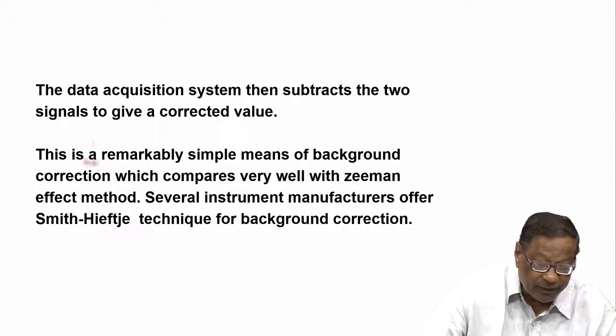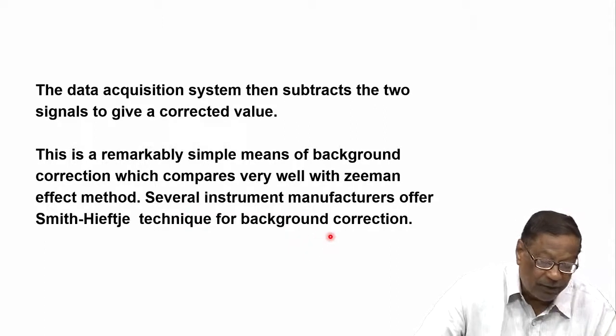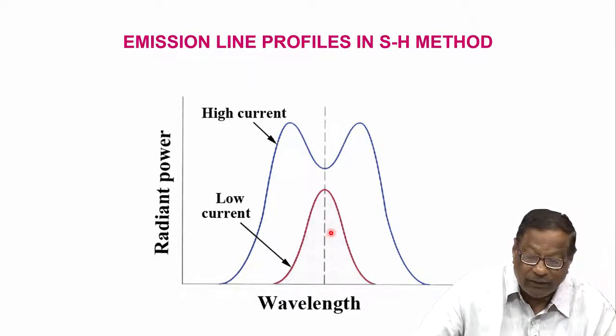So, this is a simple, remarkable means of background correction, which compares very well with the Zeeman effect method. Several instrument manufacturers offer the Smith-Hieftje technique for background correction. So, all these three are available. So, this is what happens here in the absorption.